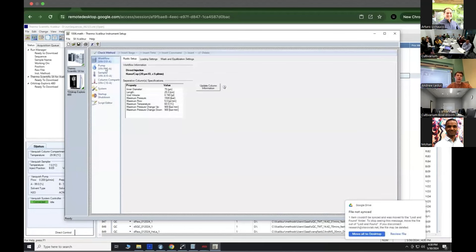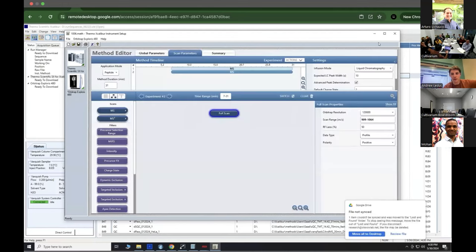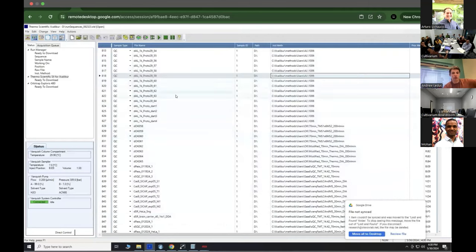You know, we usually just do something standard, like what is 7%? B to 35 or however. But there's no specific information for that here. You just leave those settings kind of how you want them. So that's the method, and then you'll just queue that up.